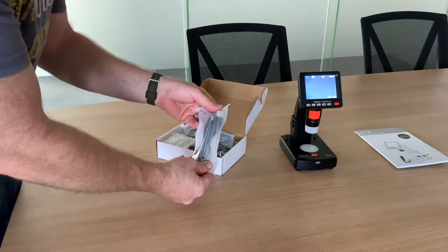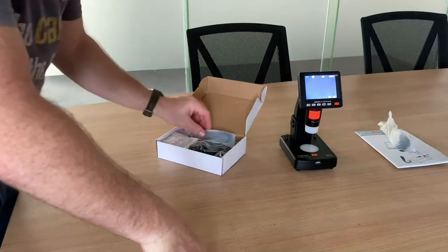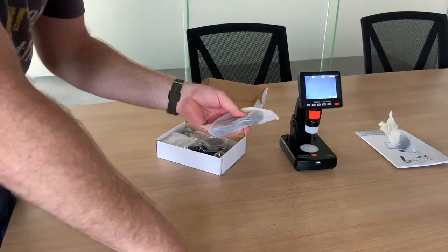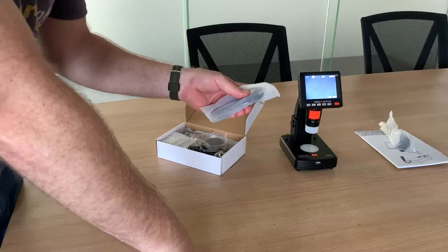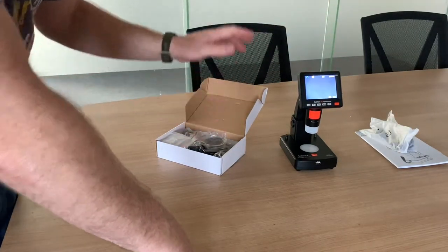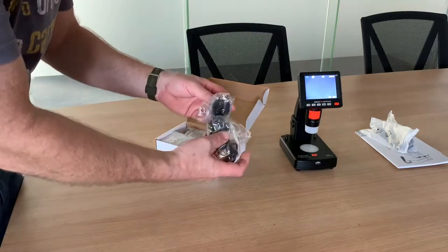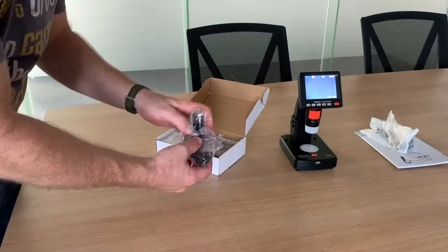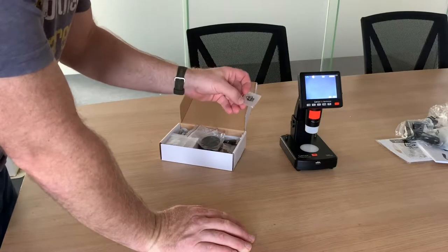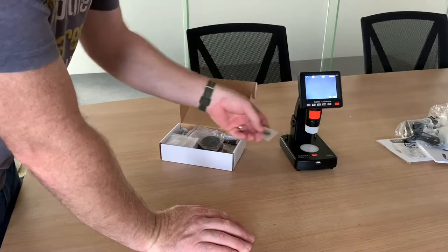You've got the HDMI and USB cable for connecting to the PC, you've got your video out so you can connect it to a TV or PC to see the big screen. The power recharging lead comes with two adapter types depending on your location. It also comes with an SD card so you can press the feature button and take a picture of what you're viewing.